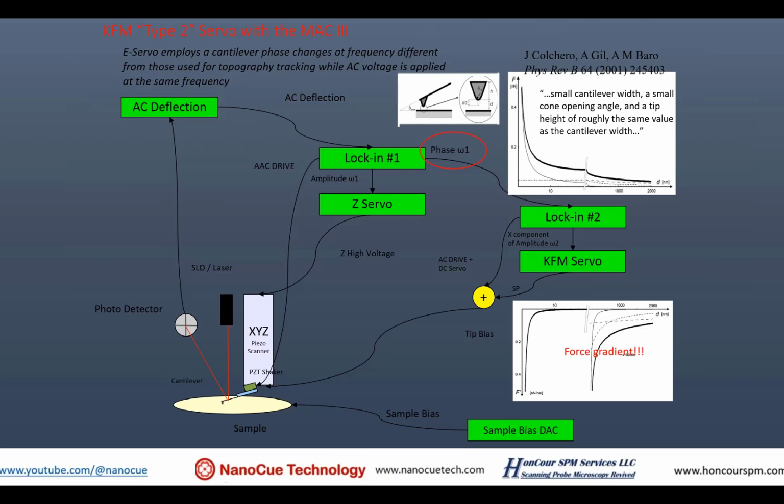Okay. Yeah. So from an application point of view, AM is much easier to operate. FM is difficult when your sample is not flat. What I found is that when the tip is climbing up and down a rough sample, the shift because of climbing just messes up the entire signal.